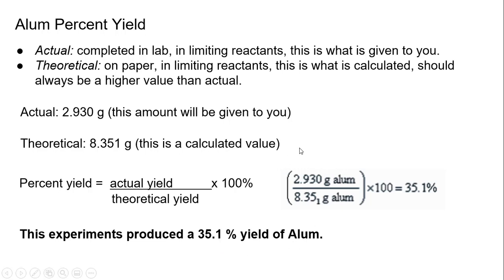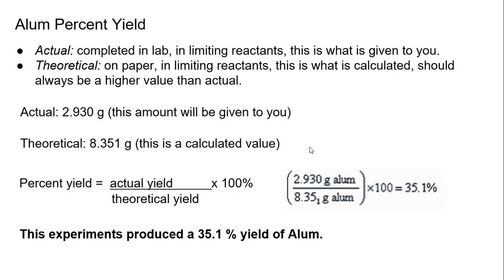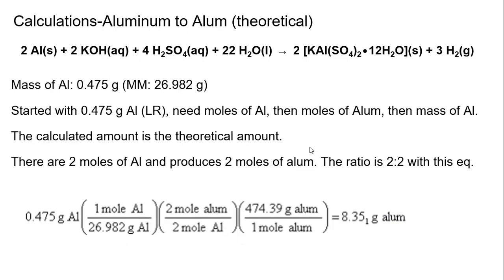This is not a difficult lab. I'm showing you the easiest way. So the 2 things that you need to do for this lab, you're actually only going to have 2 calculations, believe it or not. I've cut out everything else. You're going to have to determine the theoretical, and you're going to have to determine the percent yield. You're going to be given a whole bunch of information. Pick out the parts that I'm telling you to use, which is the mass, and then go through the exact same steps, and you're going to be able to pull out your theoretical.